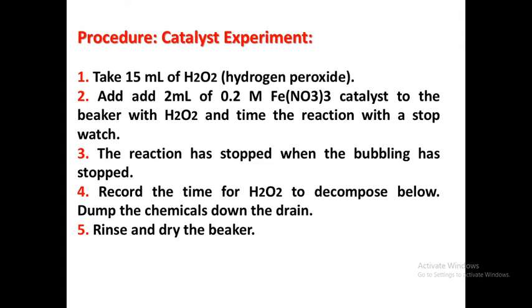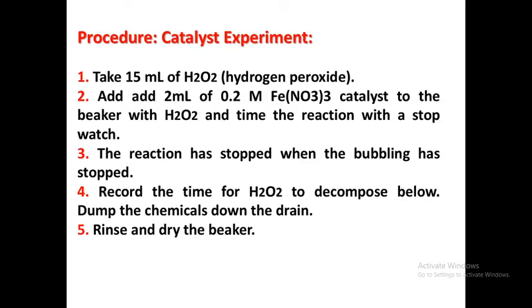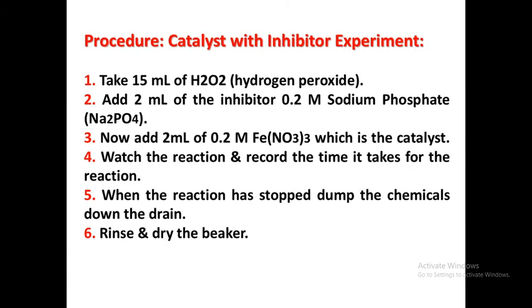The reaction has stopped when the bubbling has stopped. Record the time for the H2O2 to decompose. Second, here is the catalyst procedure experiment.